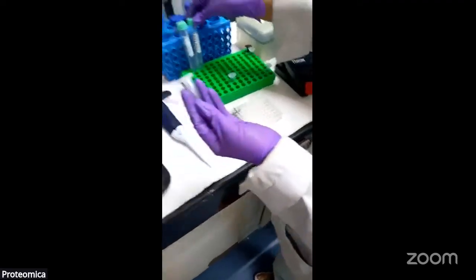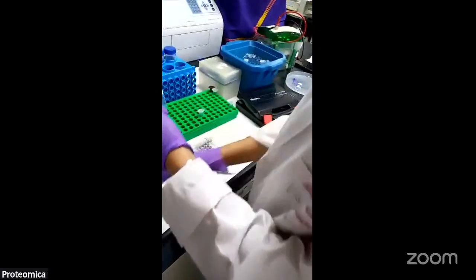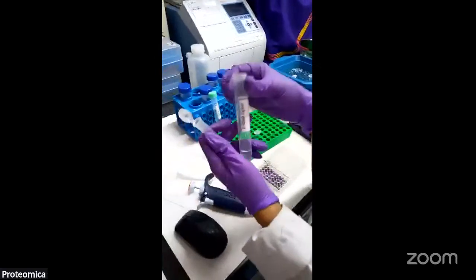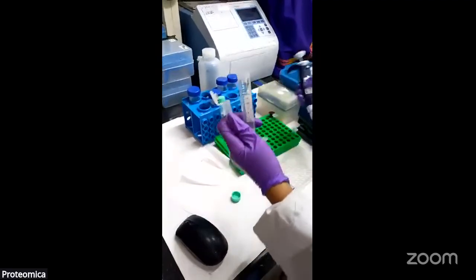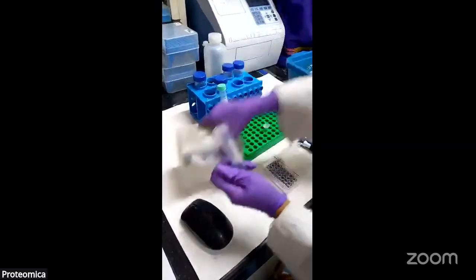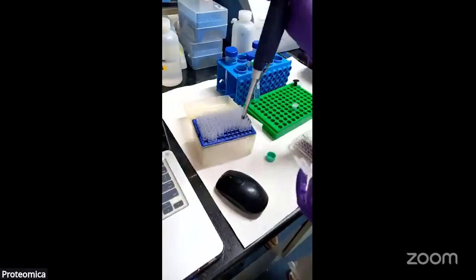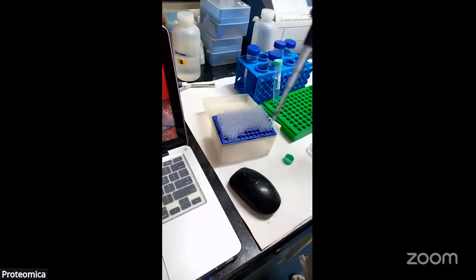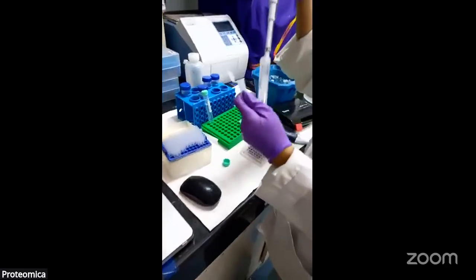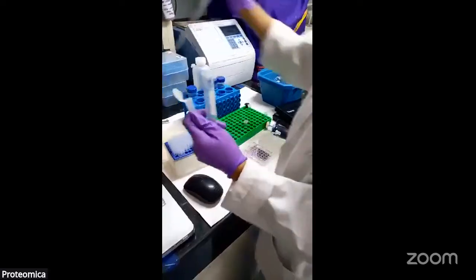You can take the concentration. You put the reducing agent, TCEP, into the lysate.